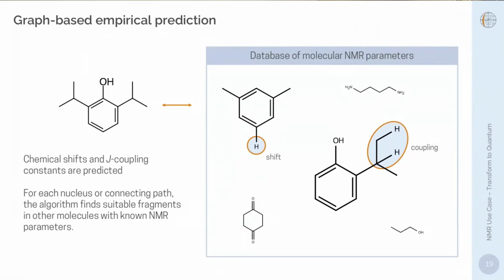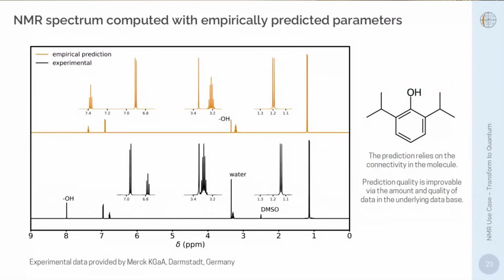So you can go ahead, run the empirical parameter prediction, and this is what we get with a development version. I would say for most nuclei, the results are actually not much worse than with DFT. Of course, you're always going to be off for some values.